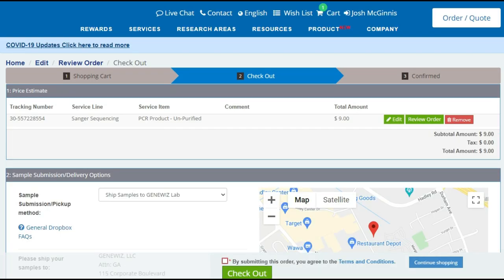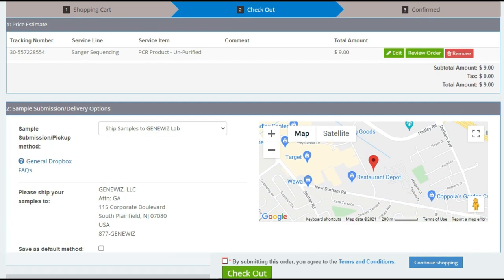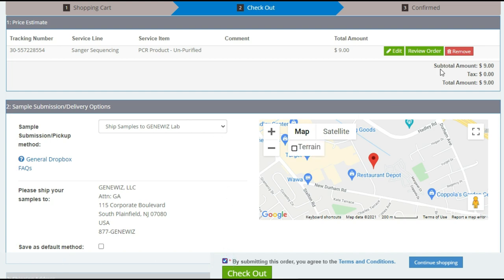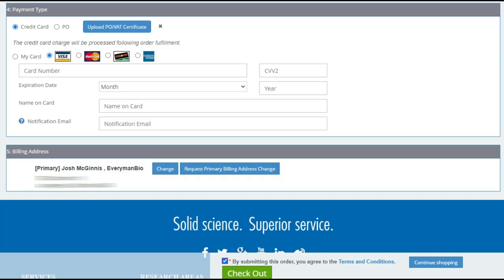And now we complete the order in the checkout screen, which starts by choosing how we want to ship the samples to GeneWiz. There's a lot of options. You can drop them off in certain areas. In this case, we're going to be overnighting them with FedEx. We'll also need to choose how we're going to pay. In this case, I like to pay with a credit card. We'll select the billing address. Select the terms of service. And then checkout.